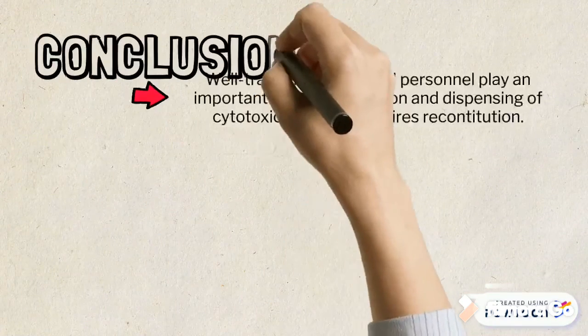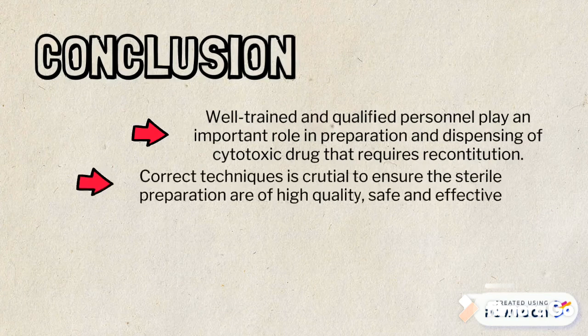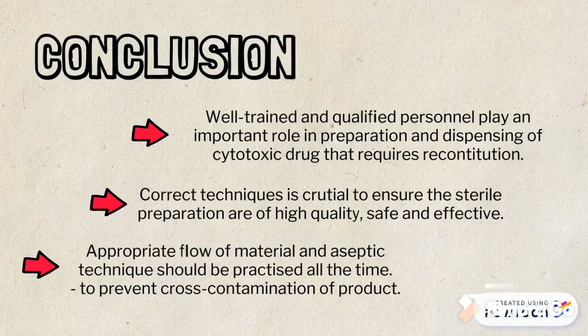In conclusion, well-trained and qualified personnel play an important role in the preparation and dispensing of cytotoxic drugs that require reconstitution. Correct technique is crucial to ensure the sterile preparations are of high quality, safe, and effective. Appropriate flow of material and aseptic technique should be practiced at all times to prevent cross-contamination of product.